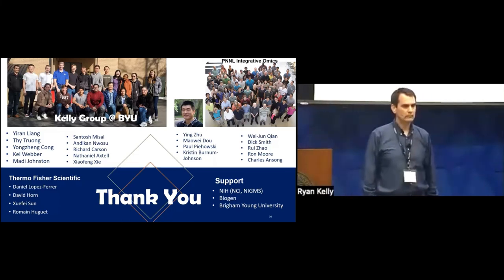But for the individual single cells, looking at things like correlating peptides that come from the same protein across the different single cells can give you, in addition to the technical CVs, some sense for accuracy. And having looked at some of this in your data, it looks quite awesome. You've looked more than me.